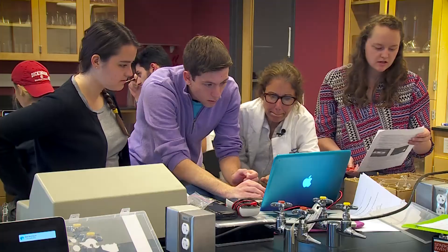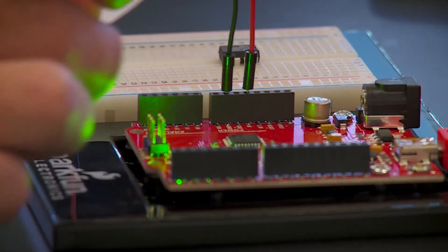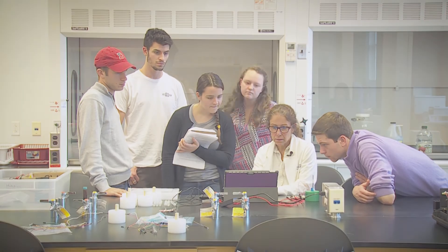We are at the forefront of using this type of approach for teaching instrumental analysis. It's really helpful when you build it yourself — you have a much better idea of what's going on than when you just push a button on a machine and write the value down.